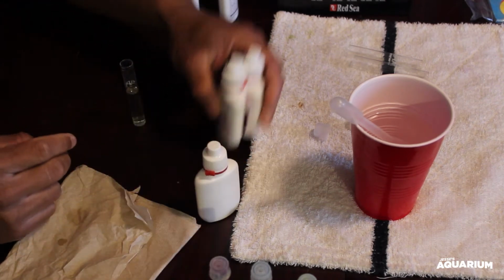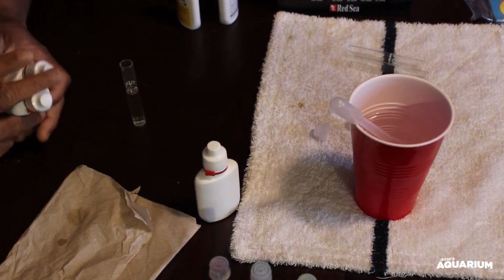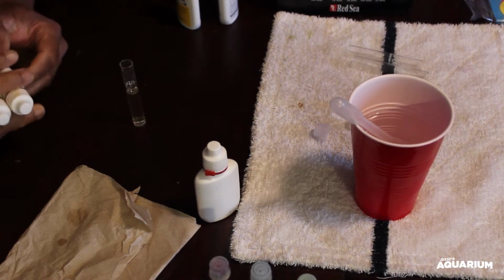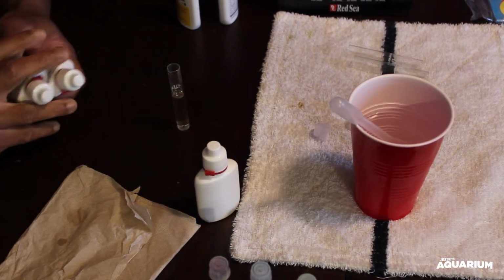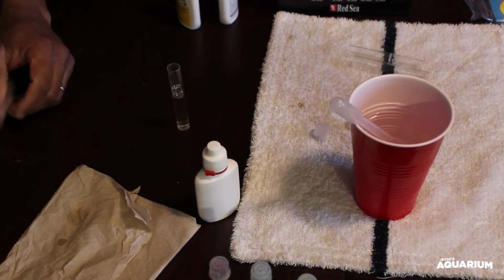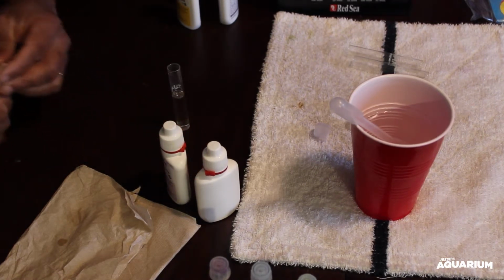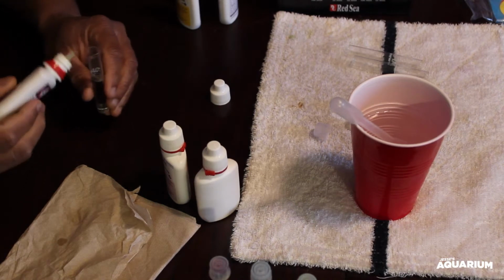Next one we're going to do is nitrate, and it comes with 2 vials as well. It requires you to shake the second bottle for at least 30 seconds before you add, or after you add the first bottle of solution to your test vial. I like to just go ahead and shake both of them for 30 seconds. Alright, we'll start with the first one. It requires 10 drops of the solution.